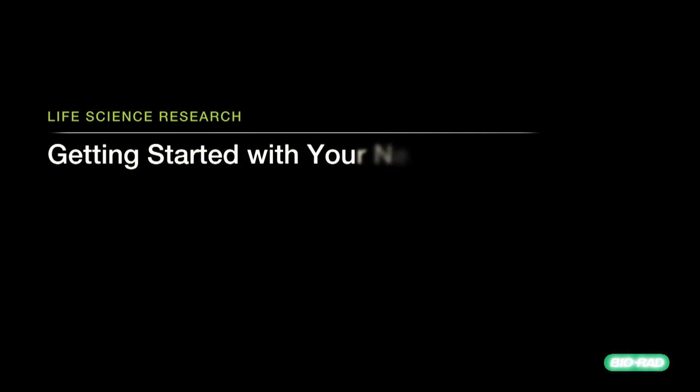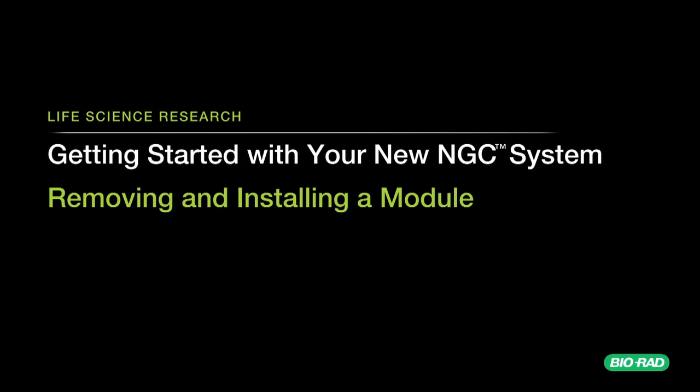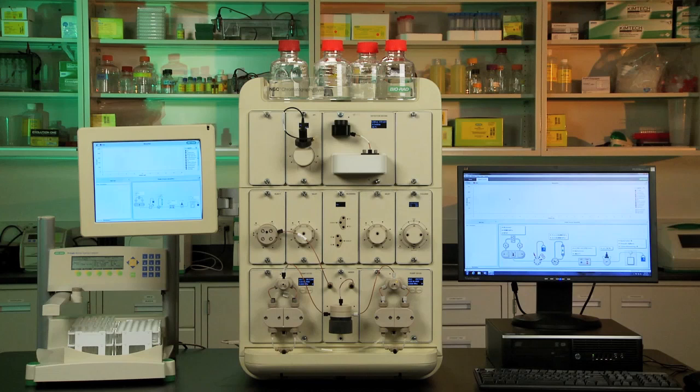This video describes how to install an additional NGC module. In this example, we will install a pH valve.